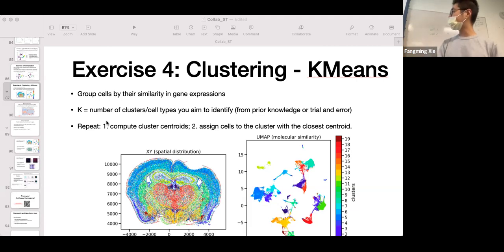Okay, so that looks better, but something still doesn't work as well as we wanted. One thing we notice is large variance across columns. It could be a good or bad thing. That just means different genes have different baseline levels of expression.